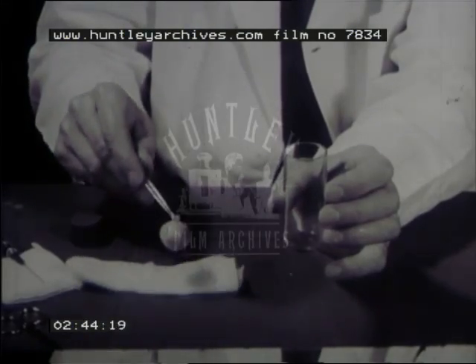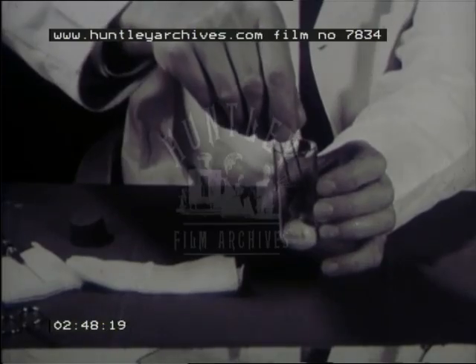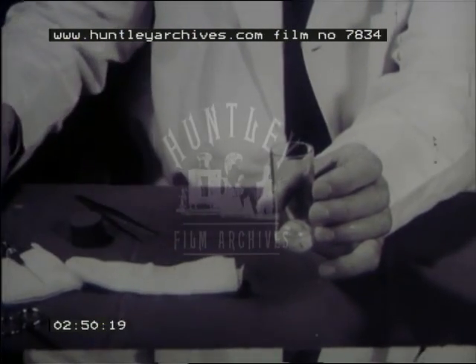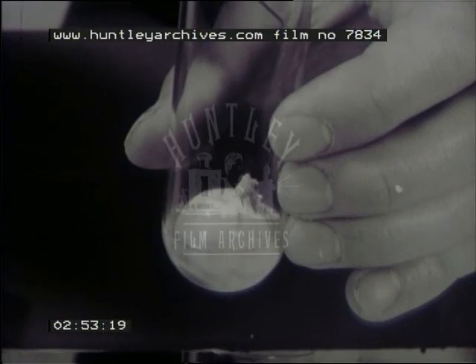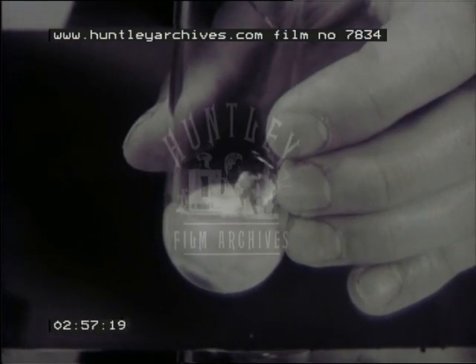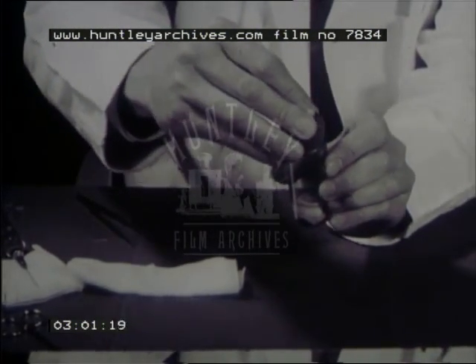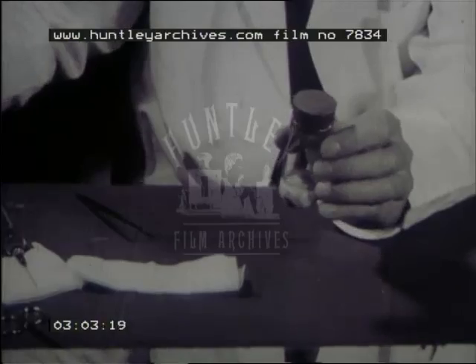The donor eye is now placed in a glass ampoule and immersed in a medium containing glycerol to protect the epithelium against damage occurring at low temperature. The ampoule is closed by a rubber stopper to prevent bacterial contamination.